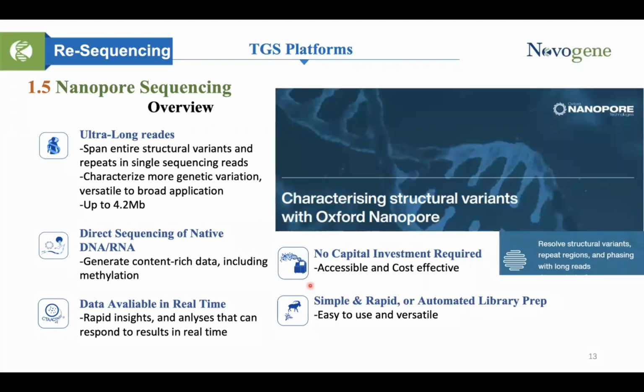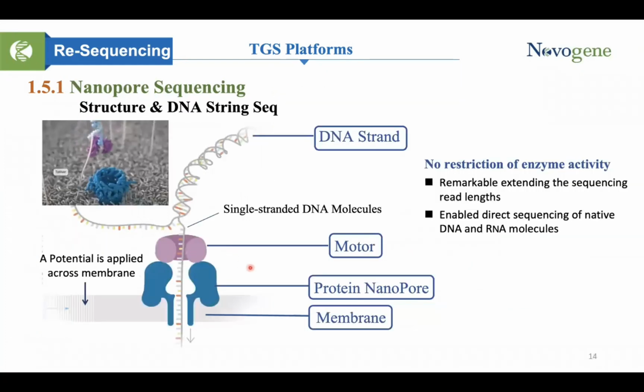And next to the nanopore. Nanopore sequencing is a unique, scalable technology that enables direct, real-time analysis of long DNA and RNA fragments, generating ultra-long reads and real-time data. It works by monitoring the changes to the electrical current as an unzipped DNA molecule passes through the protein nanopore one base at a time. The resulting signal is decoded to determine the type of bases.